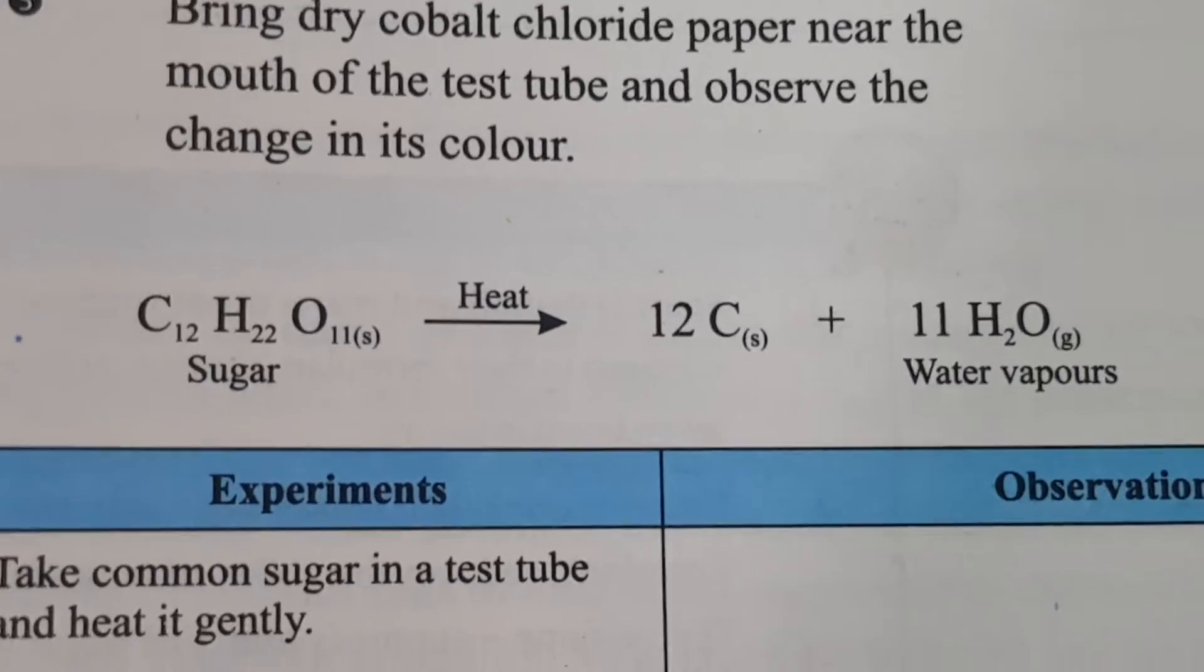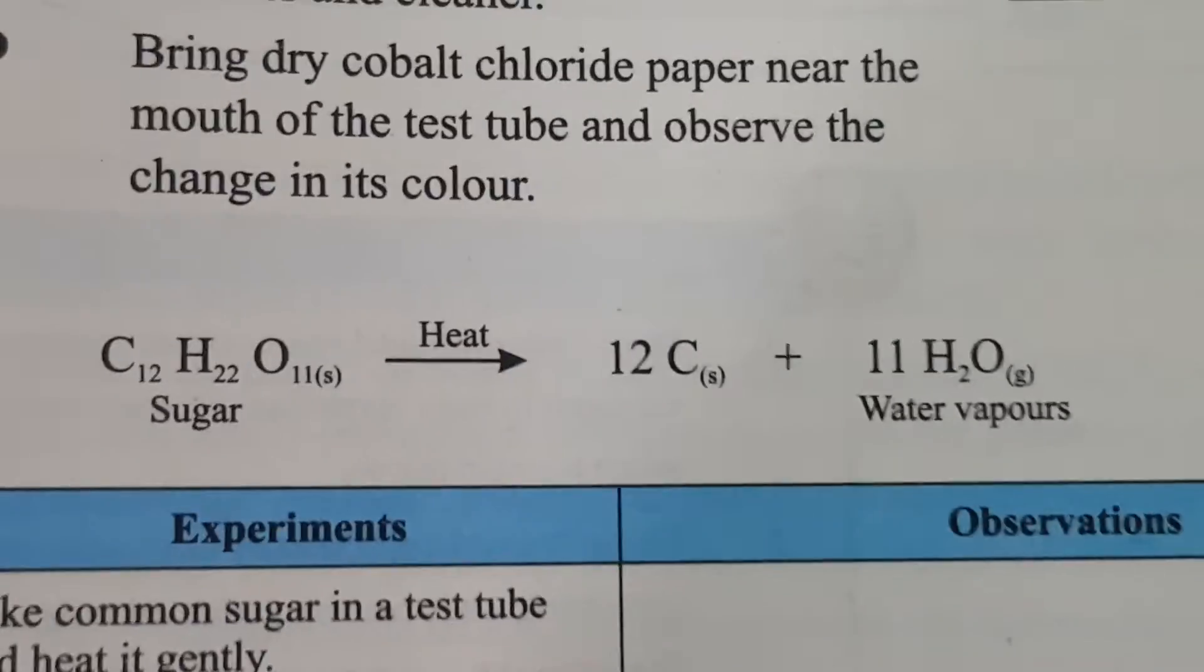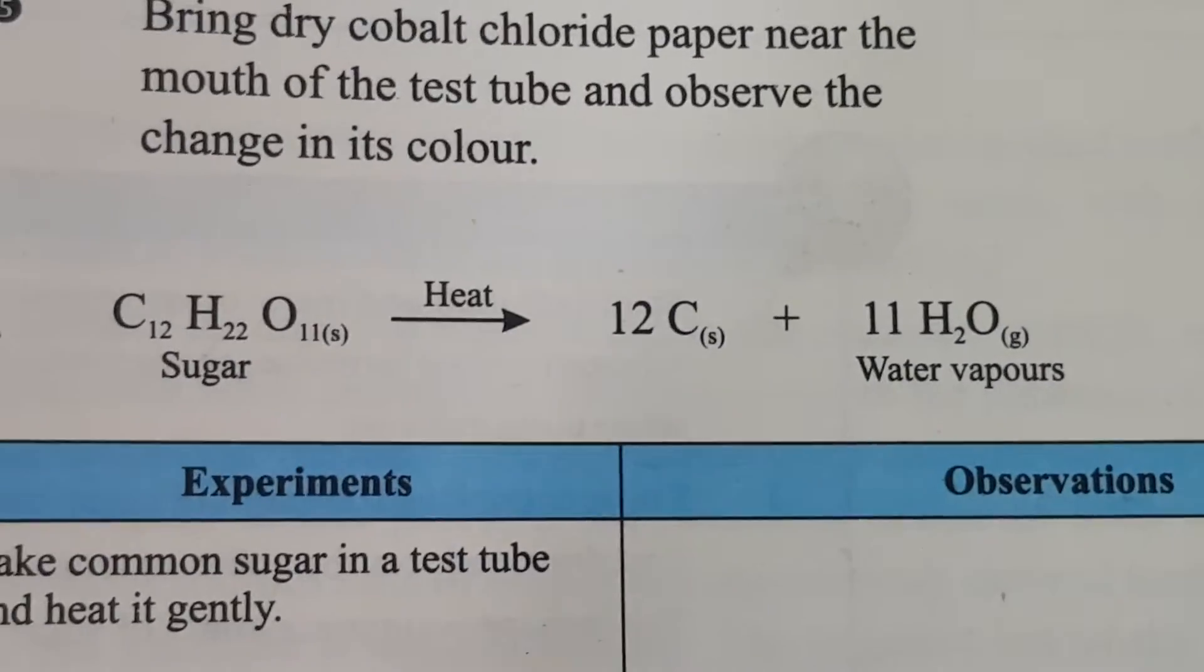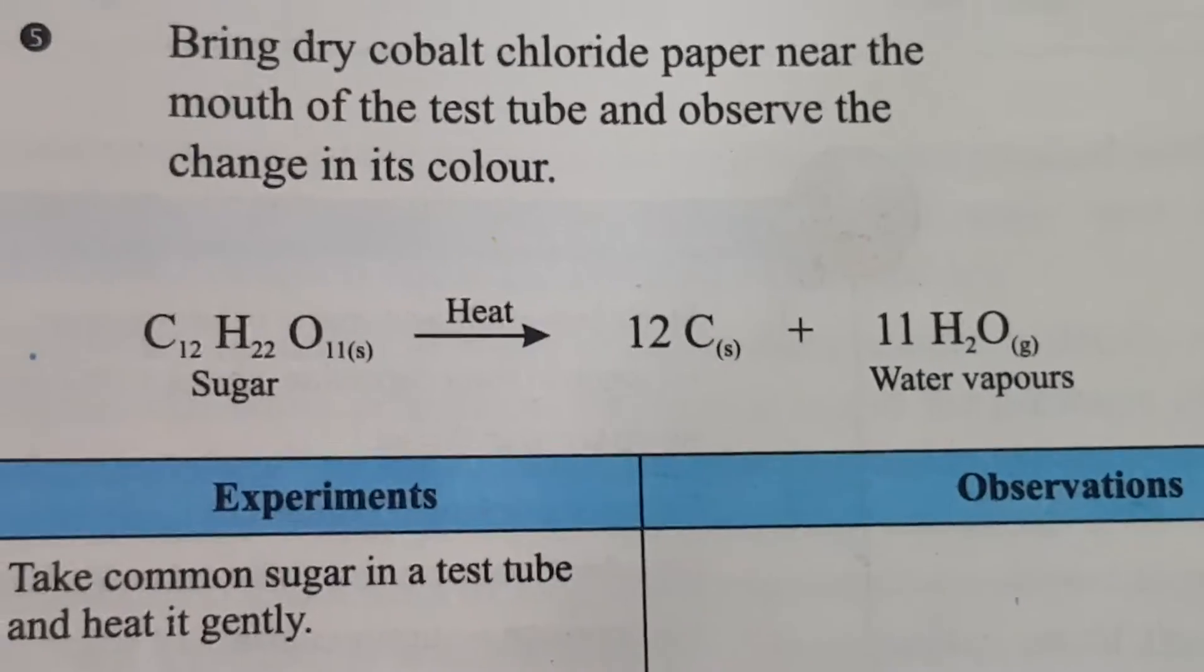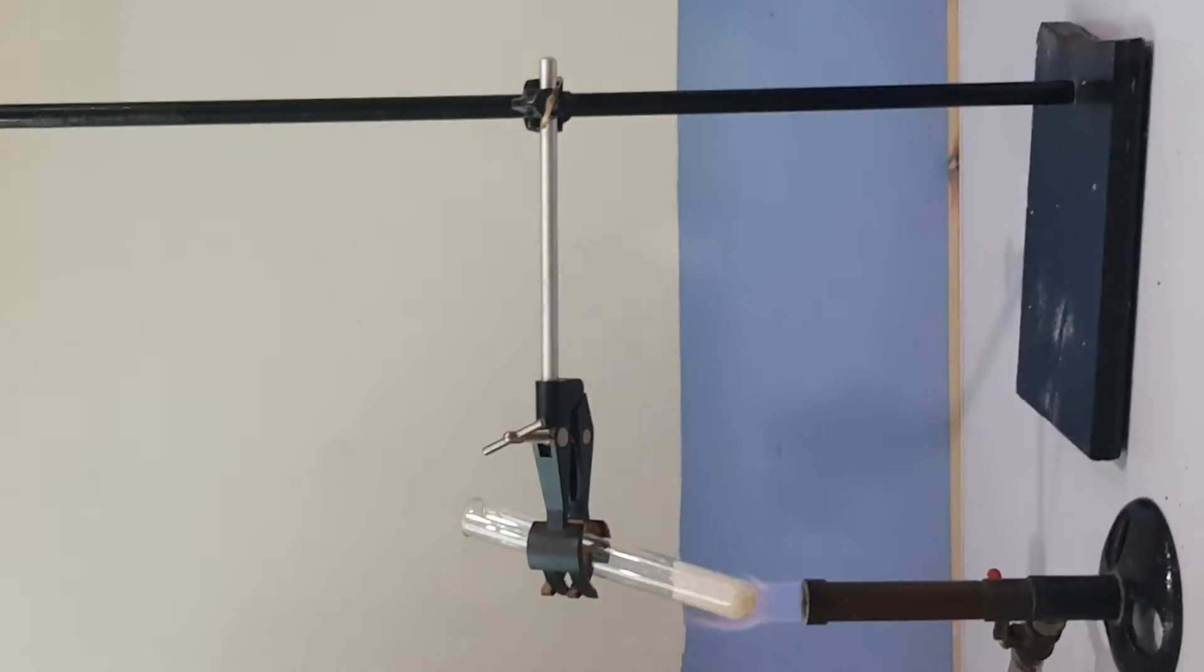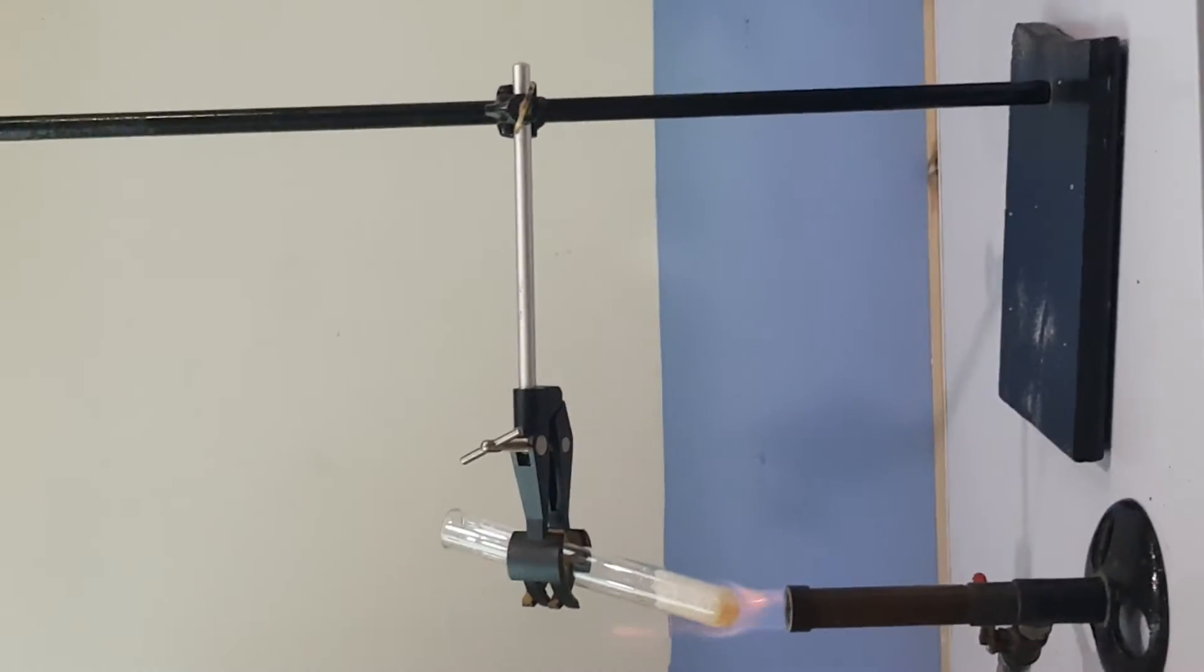To check the presence of water vapor, we will place cobalt chloride paper in front of the test tube. These are cobalt chloride papers. Now we have turned the flame on of the Bunsen burner.